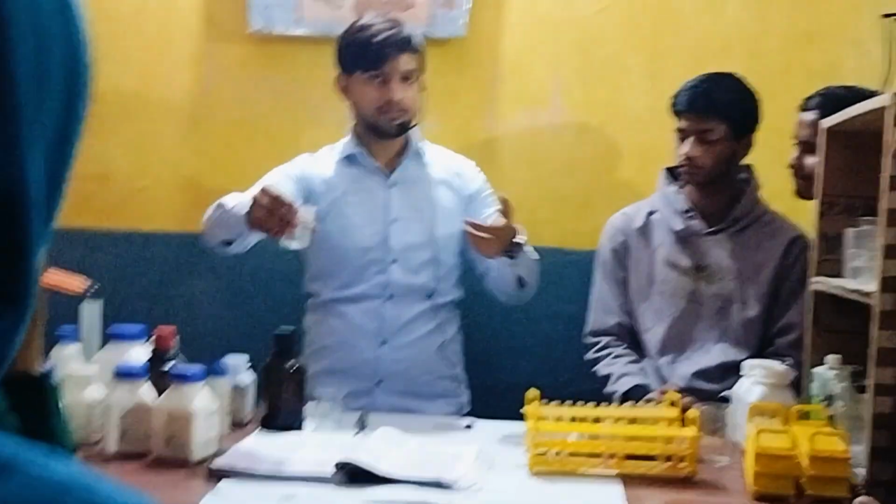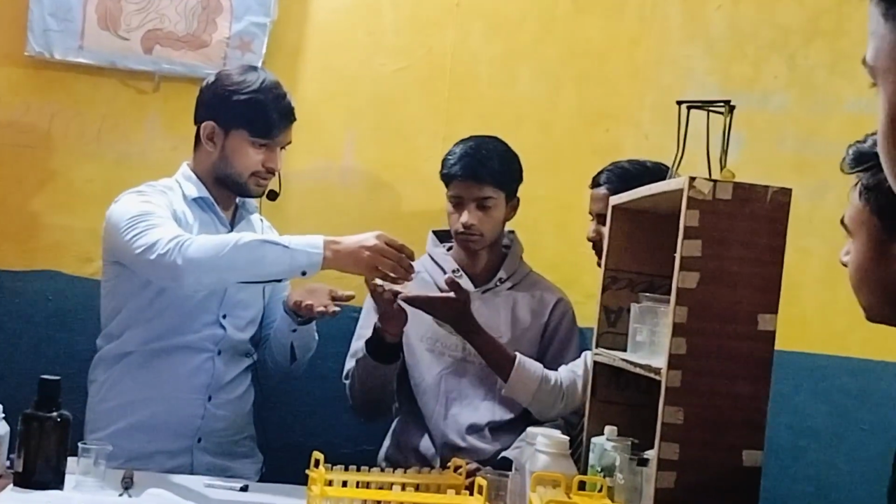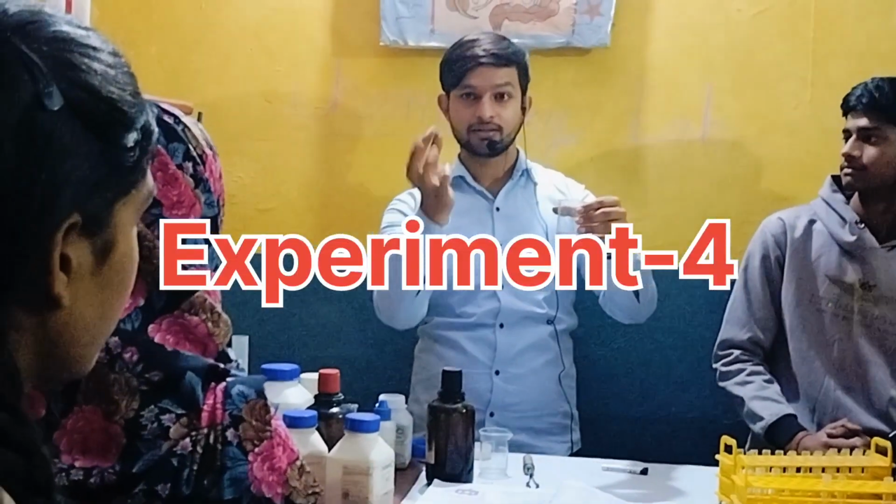And in the FeSO4 reaction, what have we done? We have given the heat. So it is an endothermic reaction. Please stretch it out from the base. Yeah, it becomes hot?